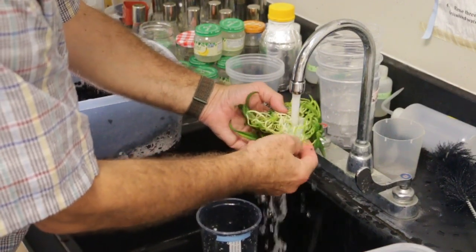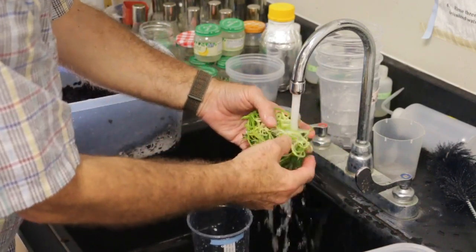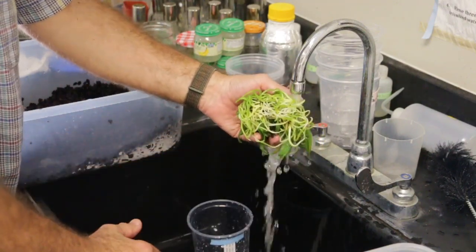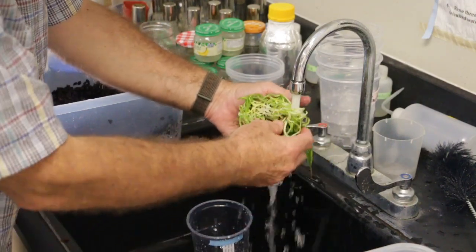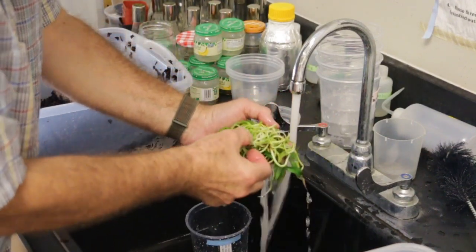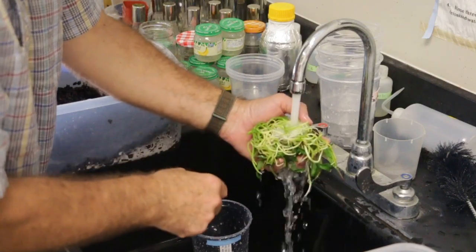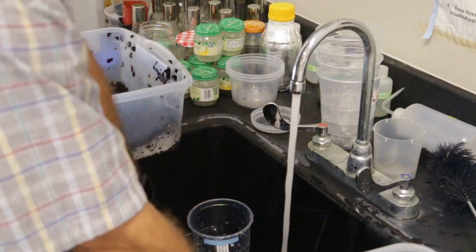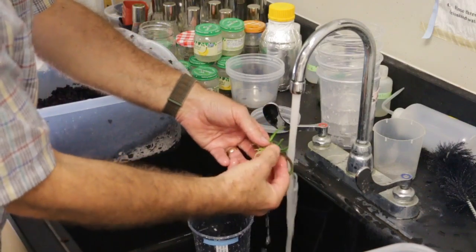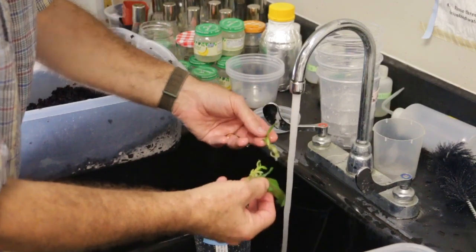But what I want you to see is the massive roots and what's holding everything together here. There's a lot of roots here, and what you have to do is tease this apart without destroying the roots. What I've seen people do is try to pick the roots apart, and they do a lot of damage to the roots. The best way to do this, like for example with this group, is sometimes you can't get them apart, and if you can't get them apart, that's it.